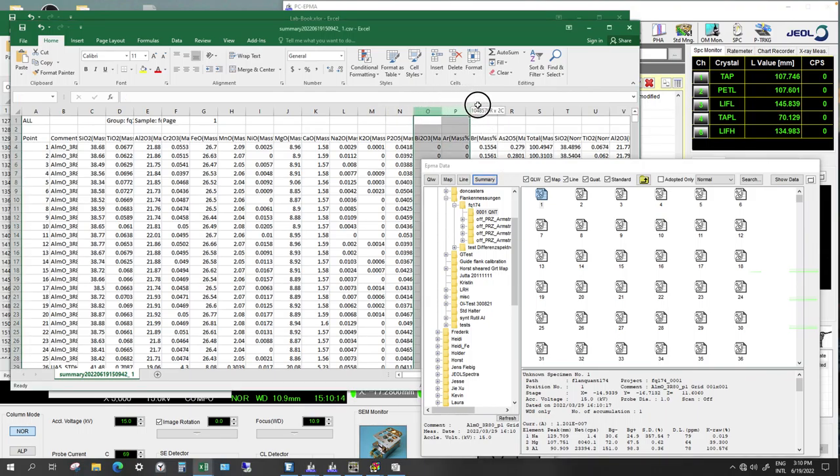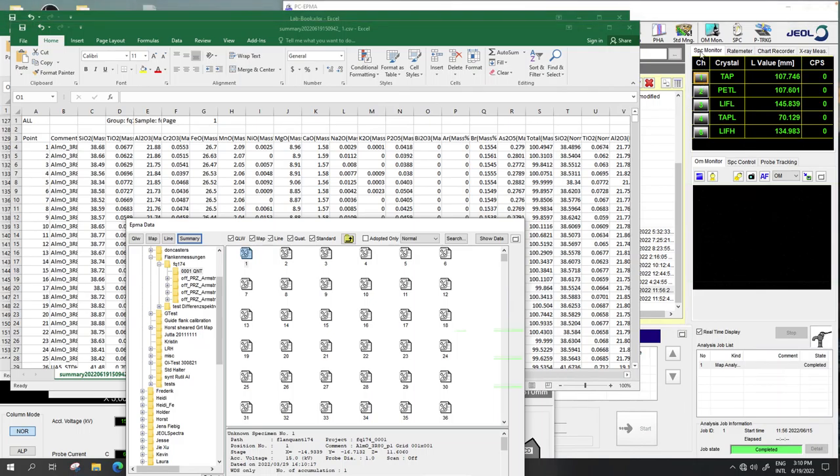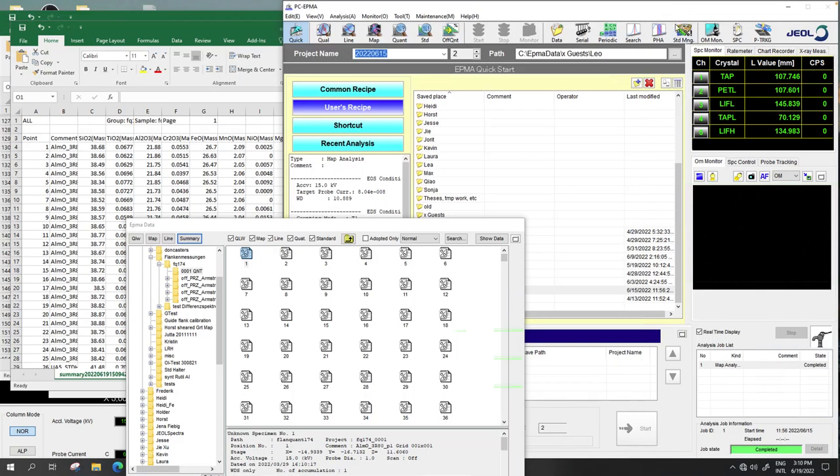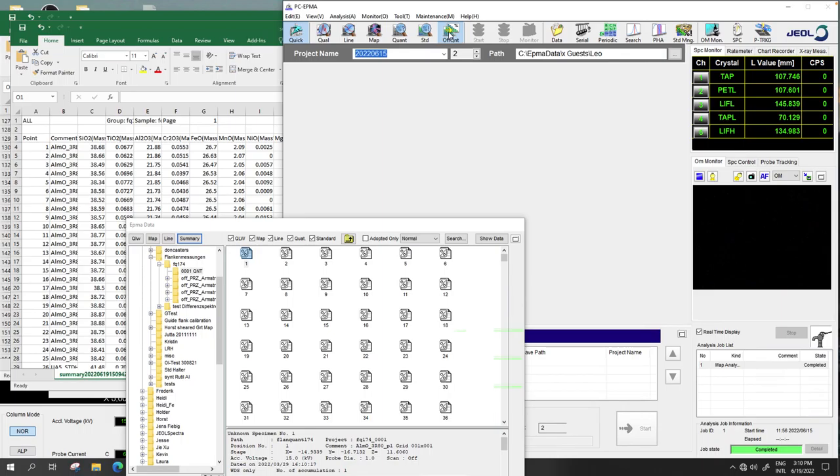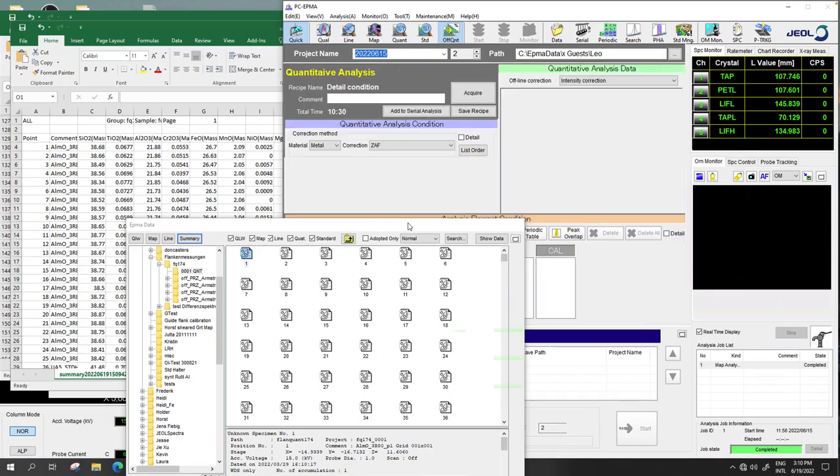Because for the element concentrations we want to make an offline correction in which we delete these fake elements here. So I will show how we are doing this. We are going to offline correction here.